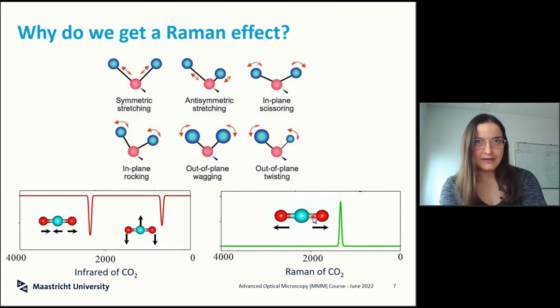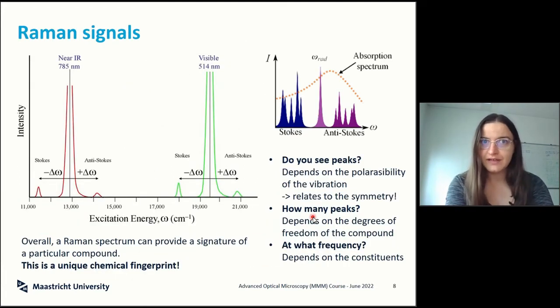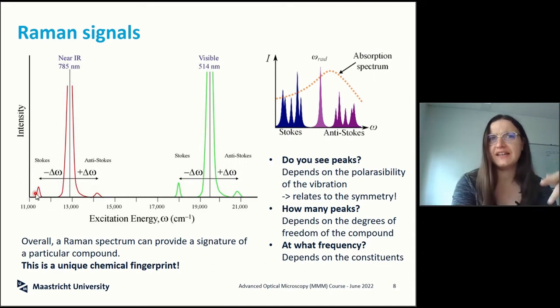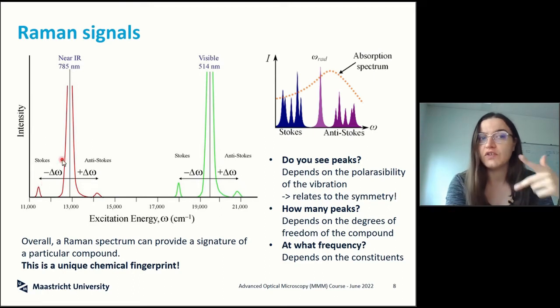So why is this interesting? Because the Raman signal in itself is a signature. The molecule, as it goes by itself, will be able to show you something that is very related and peculiar to it. And this here is showing you exactly what we were commenting on, the fact that you don't want to report the final energy, because the final energy is fine as something to report, but it's variable depending on the input of the radiation.